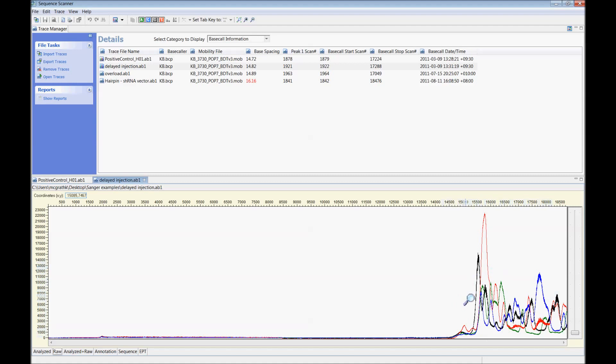This is a classic indicator of a delay. Delays happen when a charged contaminant is present in the read causing the labeled DNA fragments to run slower. Common contaminants are ethanol and salt which are often left over during extraction and purification. Always be sure to dry your DNA well prior to resuspending or eluting in pure water and never use the elution buffers that come with the extraction kits.